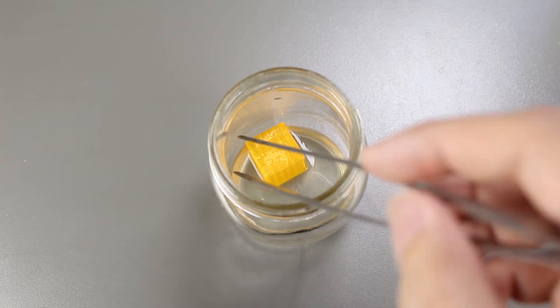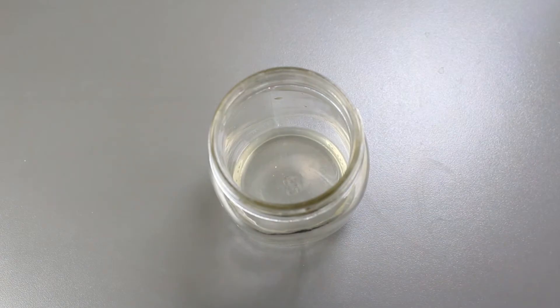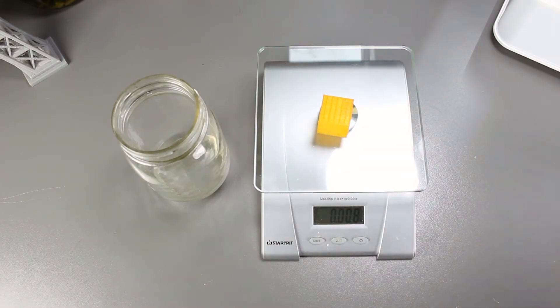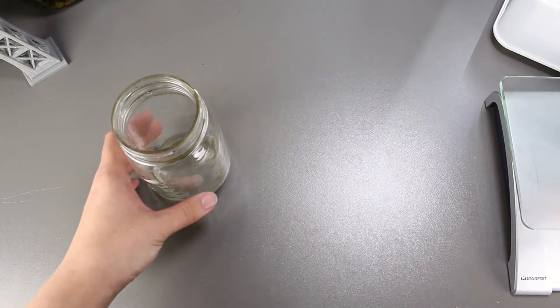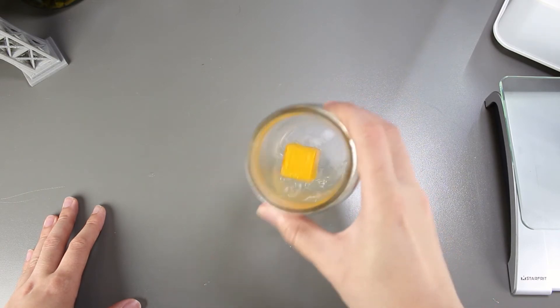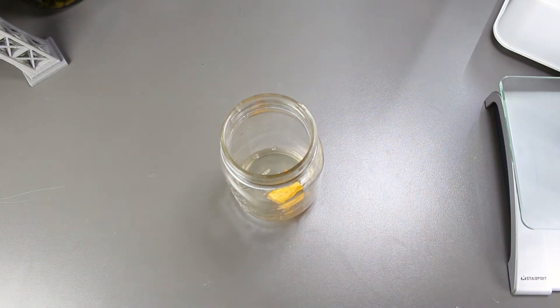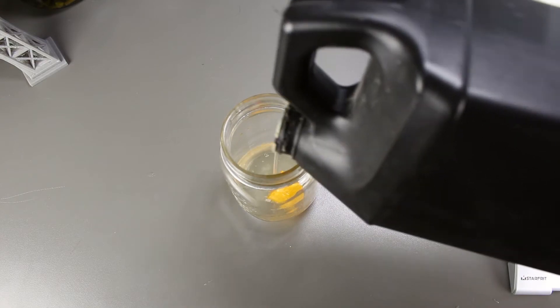Let's take it out of the jar and wipe the bacteria off and then weigh it. It actually got a bit heavier. After leaving it in for a week, the bacteria and the water actually seeped into the model which made it heavier, resulting in 8 grams. The bacteria is not very active in breaking down the PLA.